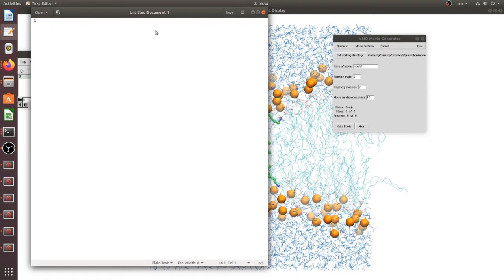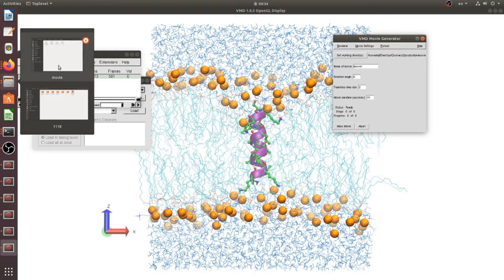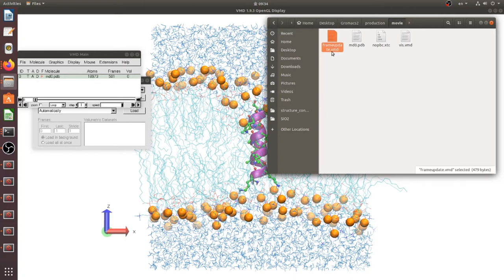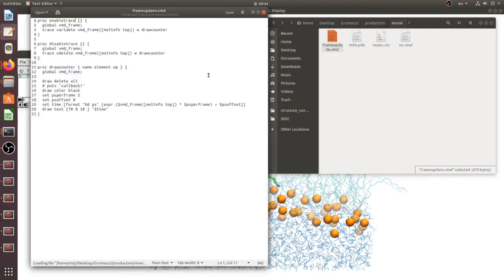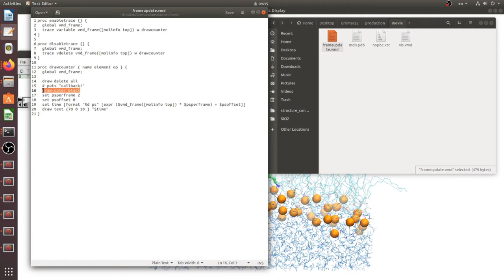I prepared frame update VMD script. You can find this from VMD software's site and you can find it, but I can also insert it in the information section. Here is black, black means time will show black.